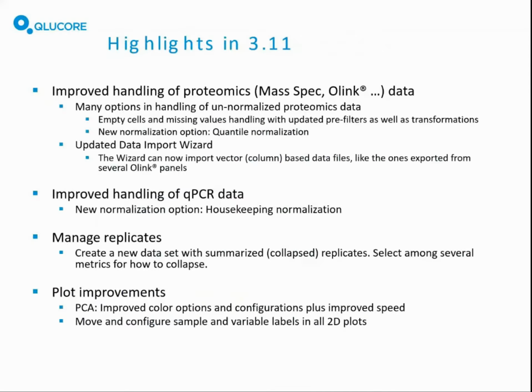The data import wizard has been updated also, so that you can import also column or vector-based data files, not just matrix data files. As I mentioned, the qPCR data handling has also been improved. One new option for normalization has been added, housekeeping normalization, which will simplify analysis for those that have unnormalized data.